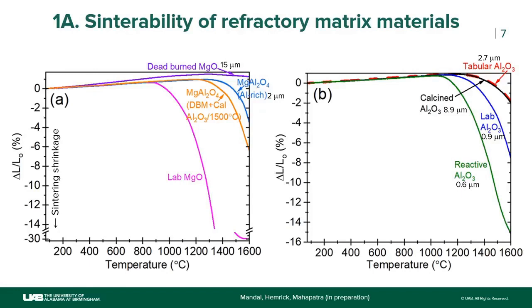It's just one test trying to replace other tests. Again, it cannot completely replace XRD. XRD is going to give you phase composition for sure. But let's say you are a startup company, or some company that does not have an XRD on its own. Then you can use this method as a one-shot, multi-purpose testing facility, you can say.